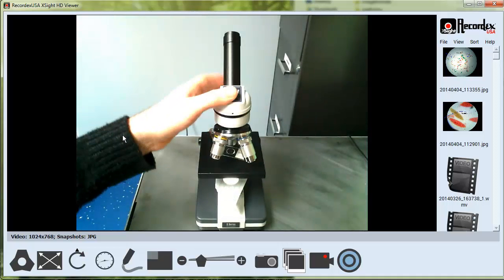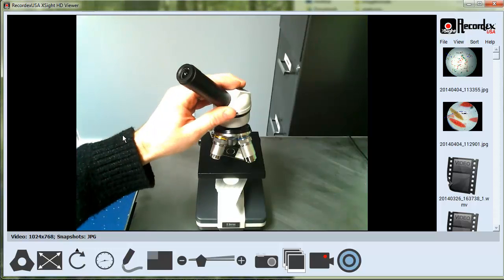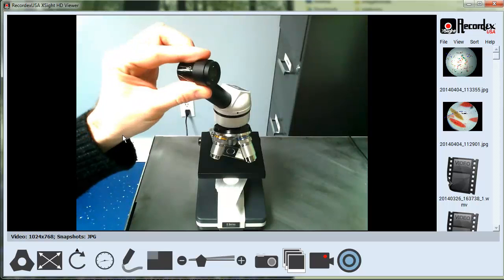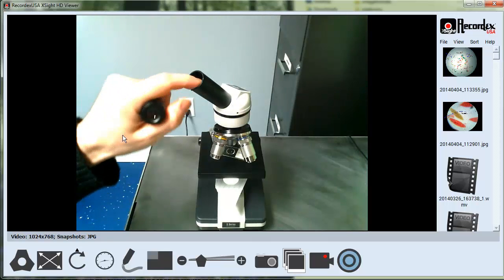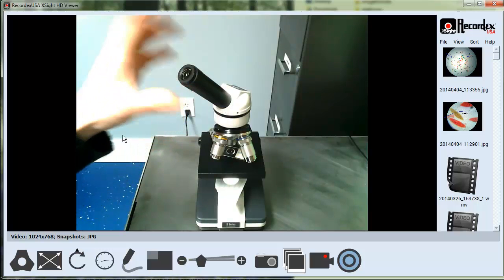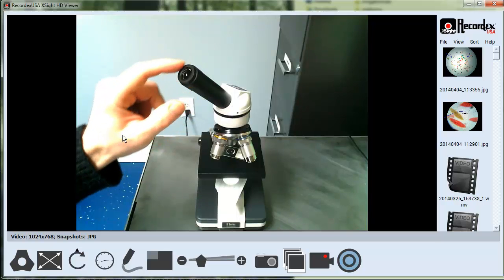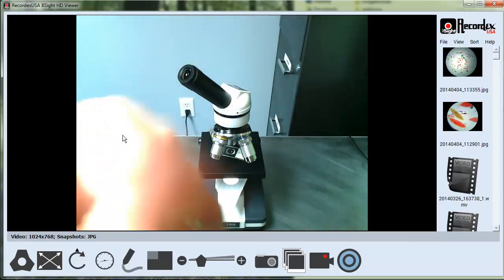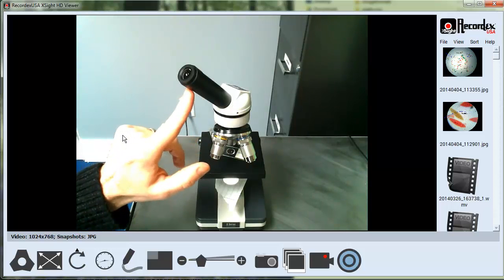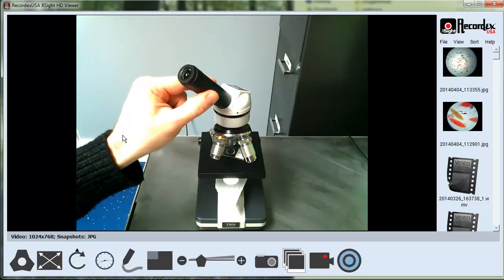So the things you'll need, of course, is a microscope, and you'll need to have purchased the optional Eyepiece Adapter, the microscope adapter for the SimplicityCam. That's this little piece here. So you just remove the eyepiece that came with your microscope and insert our eyepiece, and now that adapts the microscope to work with our camera, and this eyepiece fits perfectly inside the little lens area here of our camera. There's a little set screw on your microscope. You can tighten that down so this can't get lost, so nobody can take it out.